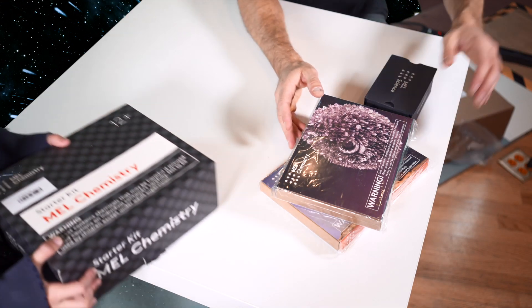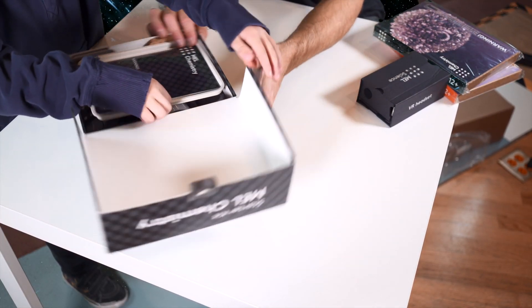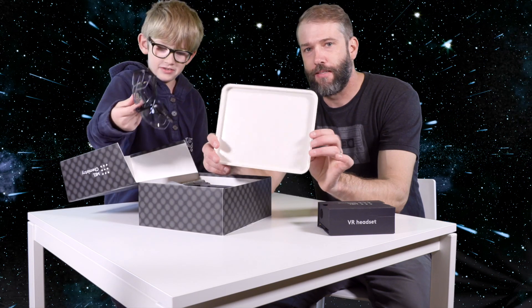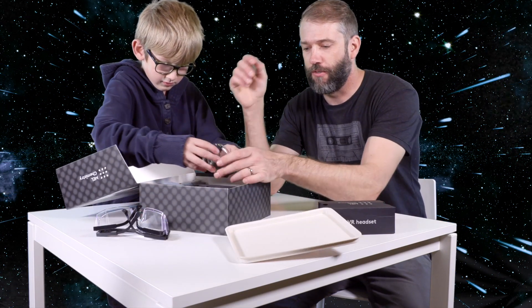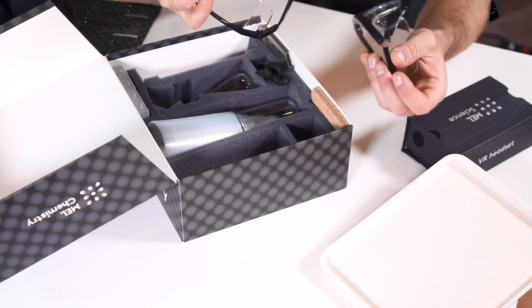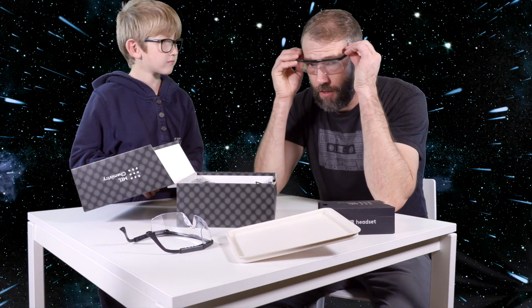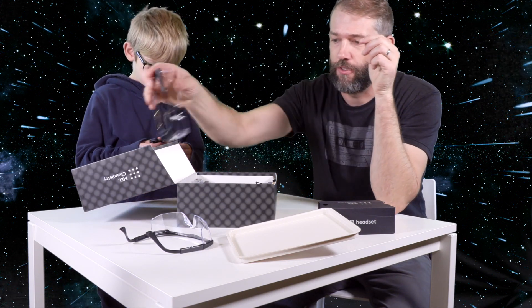We'll start with the starter kit, which I think is a bunch of basic equipment. We got this platter and we got safety glasses — a nice little plastic platter that you can, I assume, catch dangerous chemicals in. These are just your standard basic safety glasses that you would have in any laboratory. They're adjustable and they're full coverage so that you're not going to splash nasty things in your eyeballs.